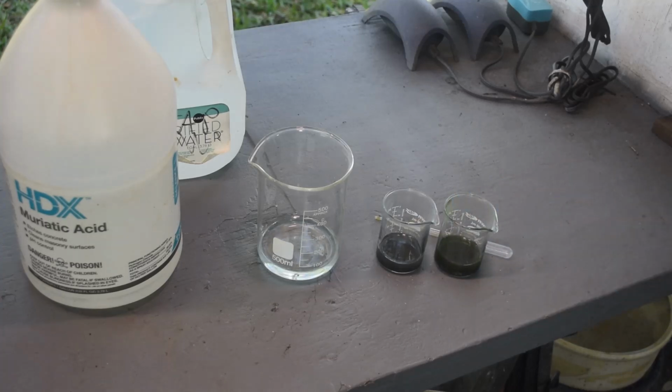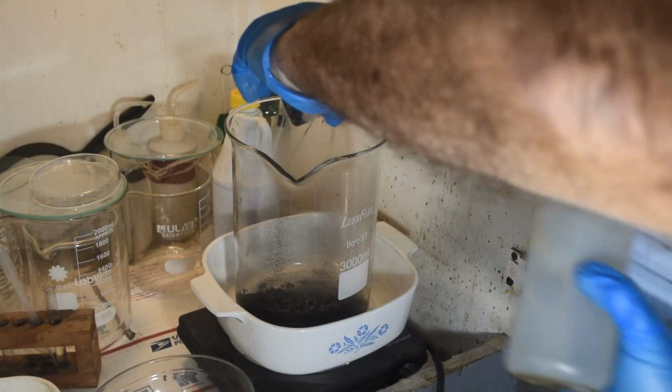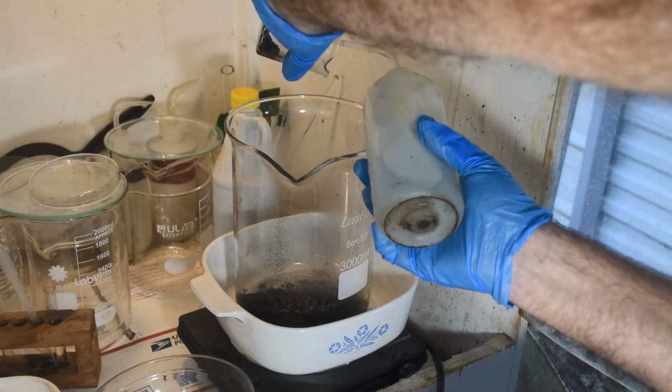So let's get to treating the bulk of the material here. I've got the bulk of our material back in the fume hood. Let me wash this stuff into it.